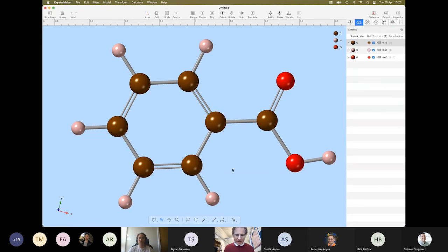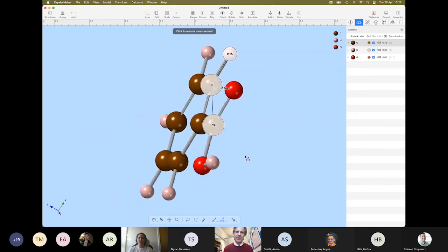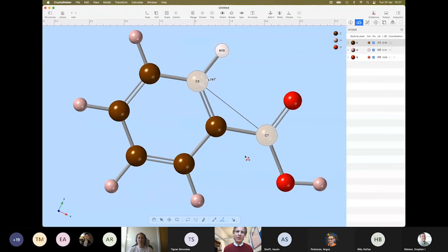Okay, let's say we want to measure angles. We can go down to the tool strip and we can use the angle tool. And again, you can hover over gaps between atoms to see the included angles. You can also click on groups of atoms, and we can interactively see the bond angle. If you want to fix the measurement, click again a third time, and now our measurement is fixed. We can rotate the structure and we can see that bond angle, 89.7 degrees.